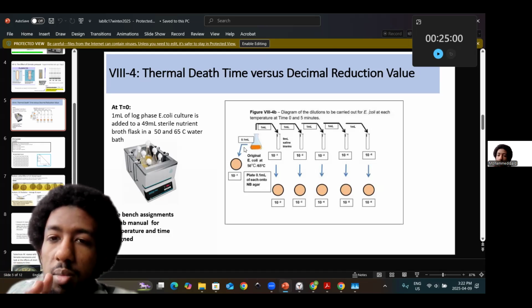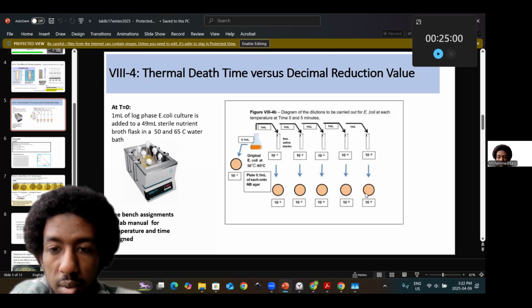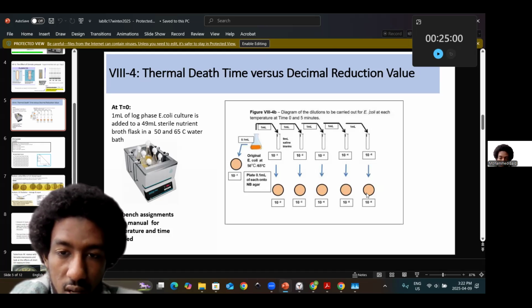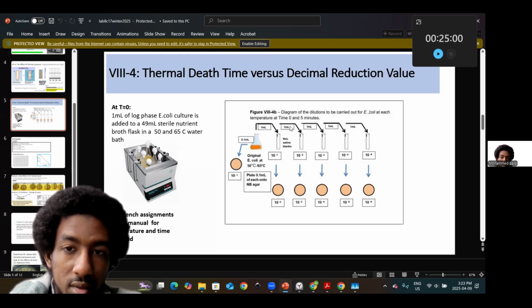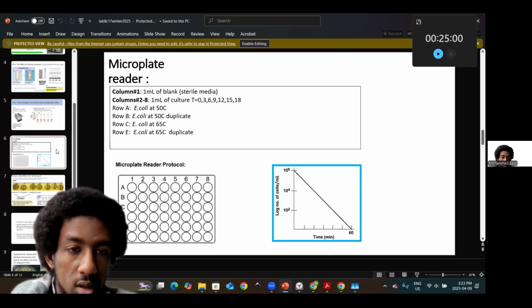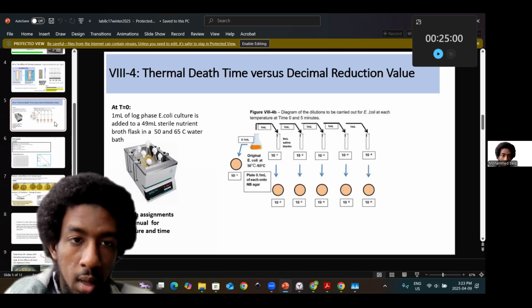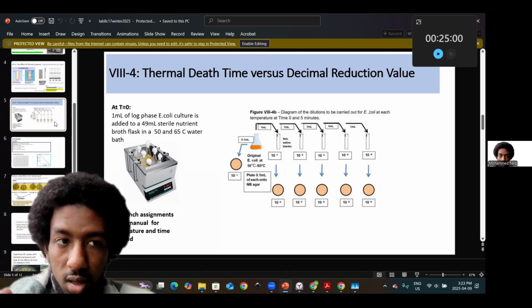So what I'm just trying to say here is that you have the serial dilution shown here, and then the implications of the plates with 10 times less of a dilution factor. And you have the second point of doing this across time, right? So I talked about this. You're doing this even for absorbances for the microplate reader, but you can appreciate that as soon as I added in the bacteria, that would have likely been assumed time point 0, and then we would have waited ideally 5 minutes.